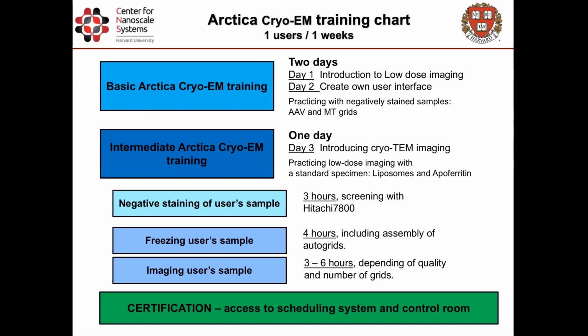We have a training attached to this microscope. Even if you don't have a sample, you might still want to see how this technology works. But even if you don't do your sample, I would still suggest getting the training so you know actually what you're doing and how it is done. There are very few microscopes available for training in structural cryo-EM because they're constantly used for collecting data. Therefore, many people come just to see how it's actually done. And because we have a prototype, we actually can go into every step in more detail than you would with the modern machines. Some of them are done like black boxes. You just go in, go out, but you don't know what's happening in the middle.